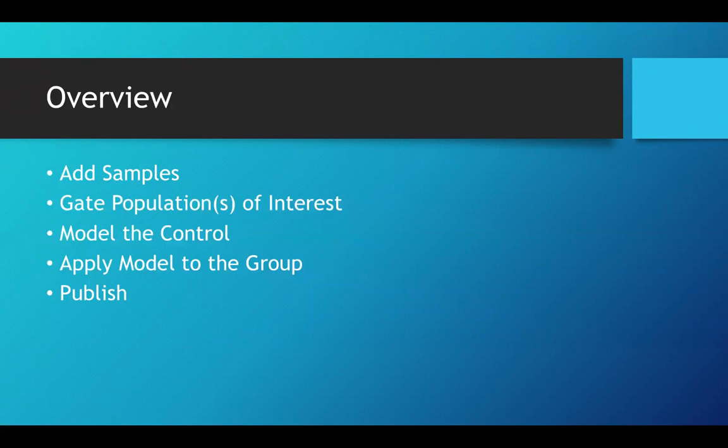If you have a mixed group of cells, what ends up happening is because each cell has a different size, right? If you're using, for example, lymphocytes and you also have monocytes or other granulocytes mixed in and you don't separate them out, the monocytes are a little bit larger than the lymphocytes, and they'll cause your peak populations in the proliferation platform to broaden out.